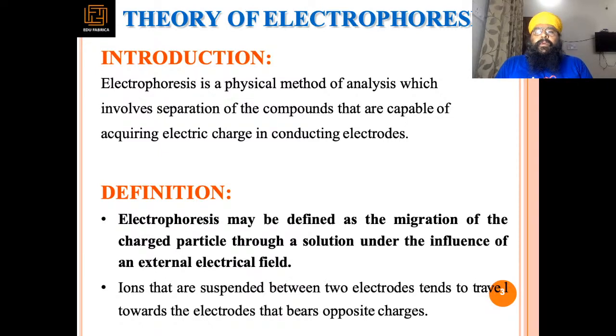Electrophoresis may be defined as the migration of charged particles through a solution under the influence of an external electric field. So ions that are suspended between two electrodes tend to travel towards the electrode that bears the opposite charge.